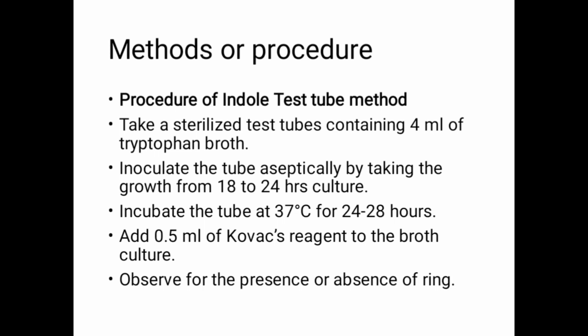Another important point is why we take a 24-hour culture: the tryptophanase enzyme present in bacteria is not stable for a prolonged period. That's why we must take a 24-hour culture. If we take a culture older than 24 hours, the test will be invalid.